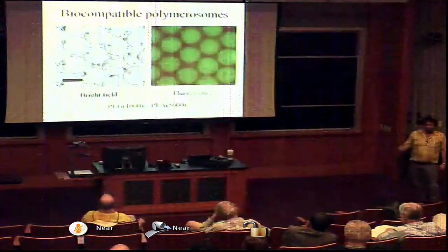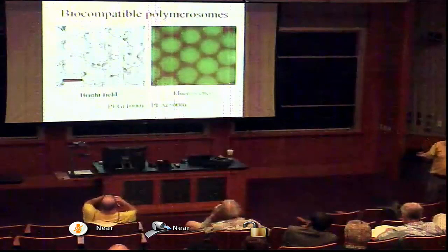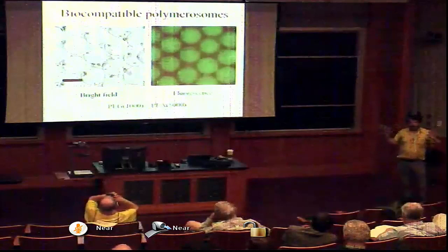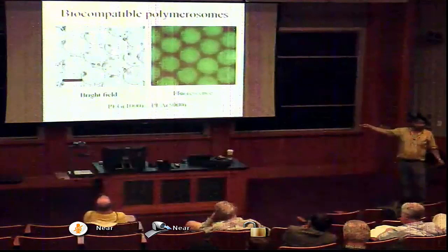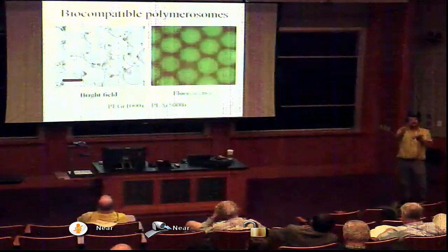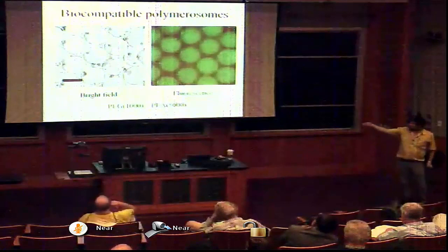It works quite well. Here I've made them out of polymers, so these are polymersomes. These are amphiphilic polymers. These particular polymers are completely biocompatible. They're completely safe to use for biological uses. You can see these are the structures viewed with the microscope. First of all, they're very uniform in size. They all have a little ball of excess polymer. The reason is you want to make sure you completely cover the interface, so you put enough polymer inside the solvent to cover the interface and have a little excess, and that's what you see here.